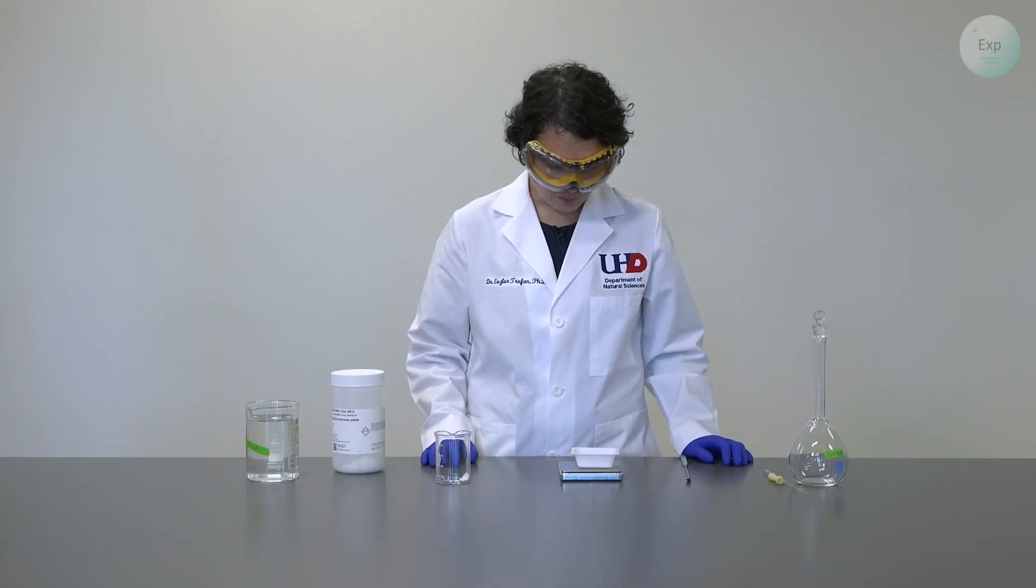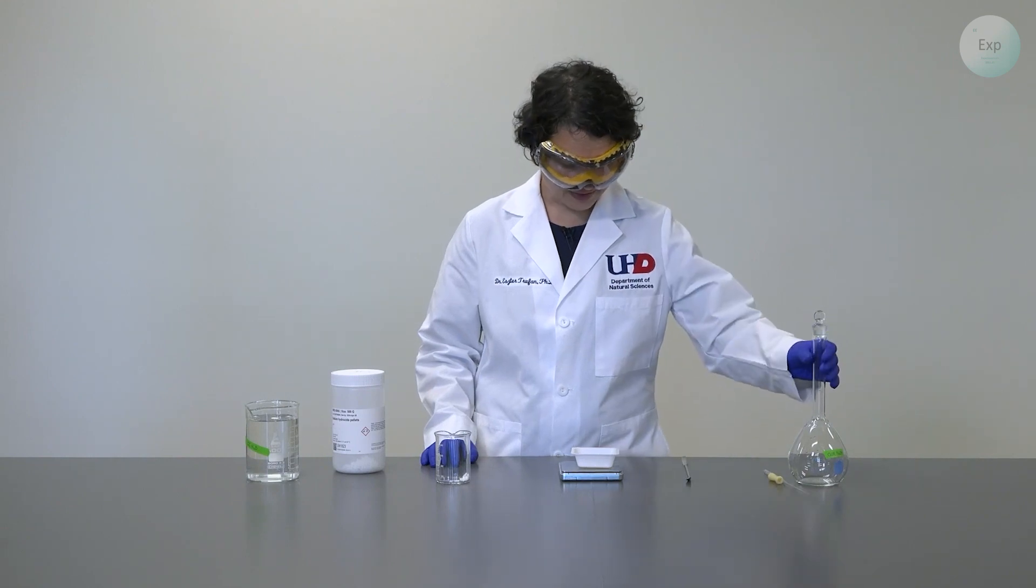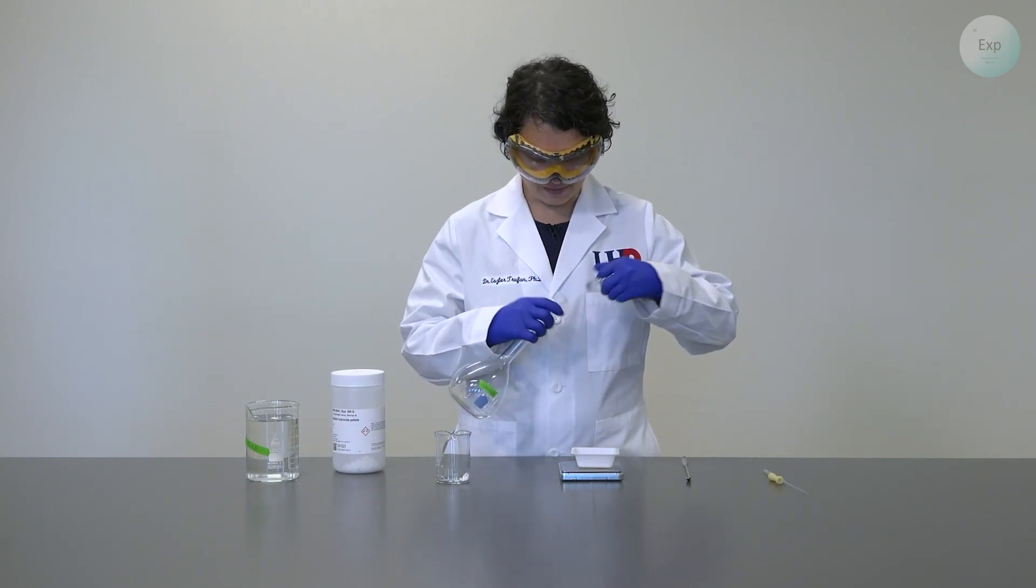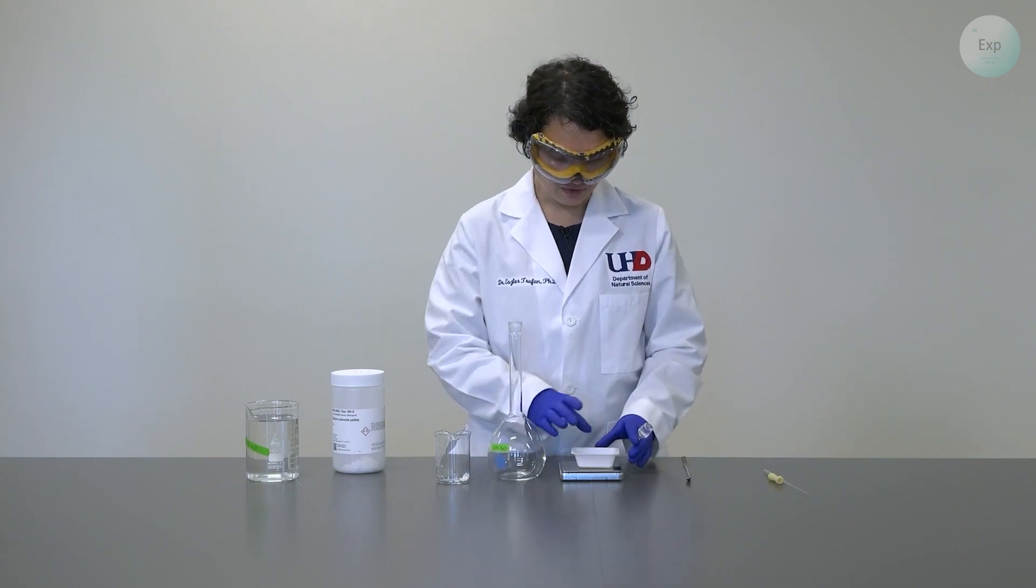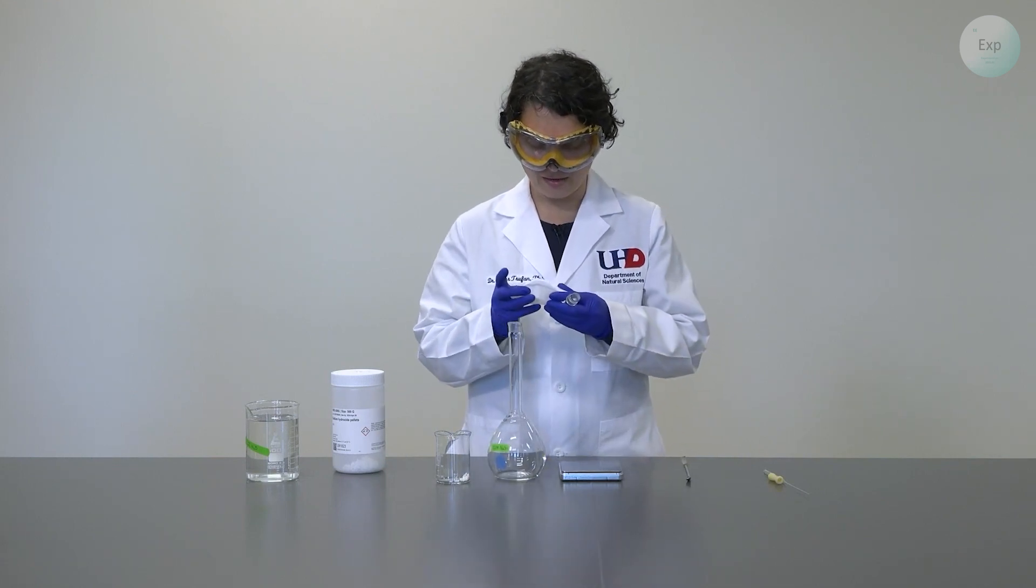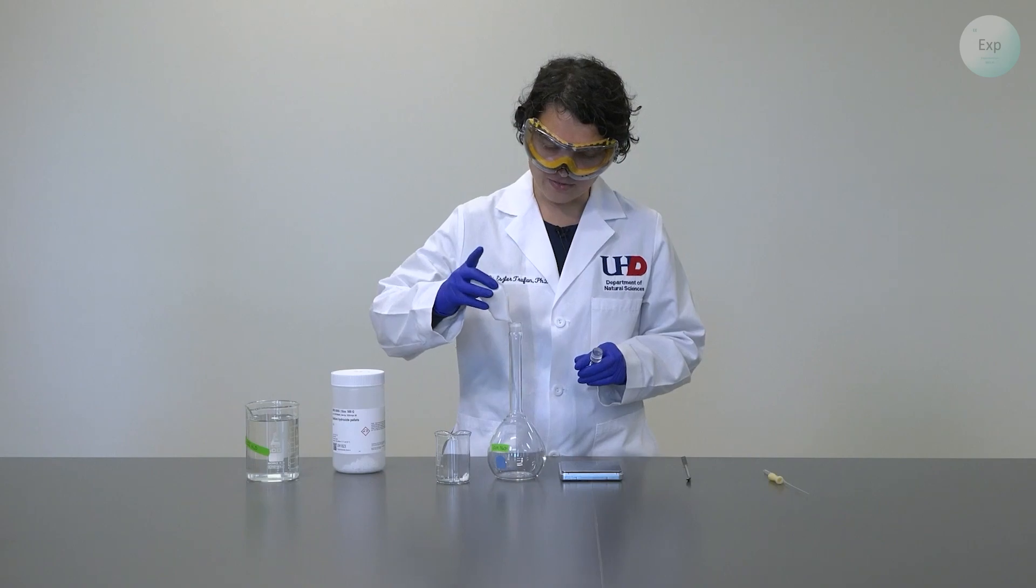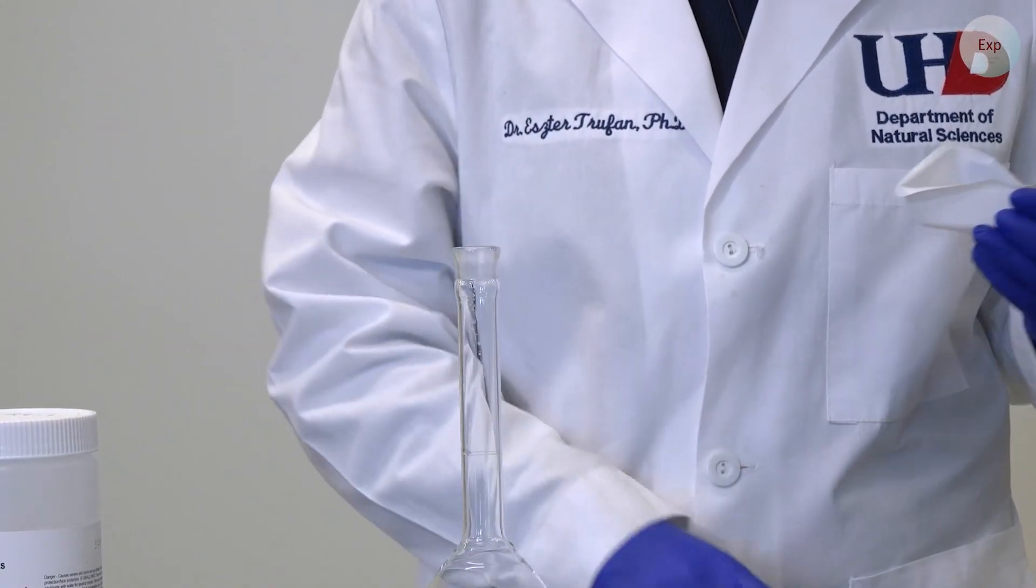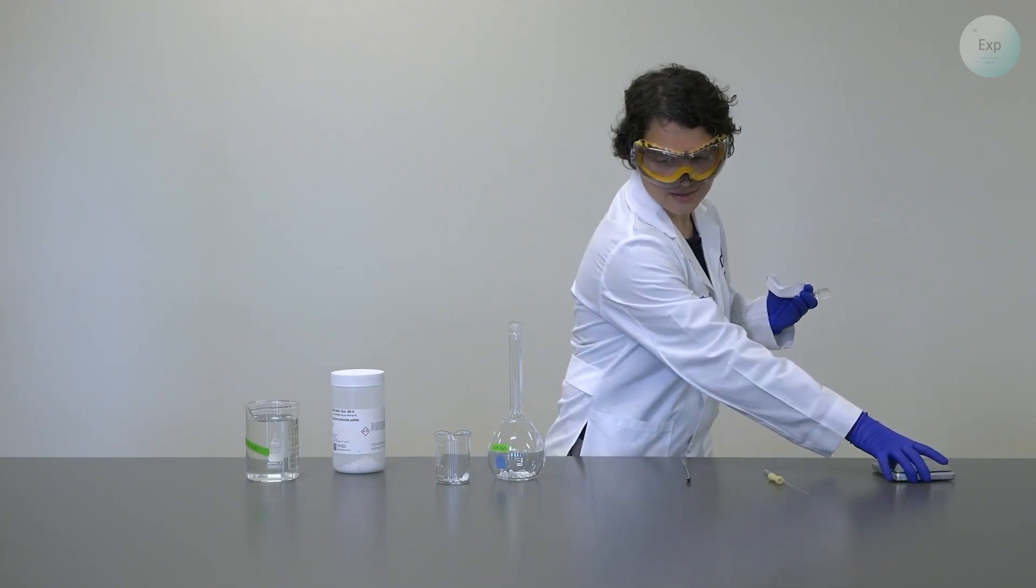I measured out exactly 2.00 grams of sodium hydroxide pellets. With that, I am done with my scale. I will take my volumetric flask, open it up, take my weighing boat, and transfer the sodium hydroxide pellets into the volumetric flask. With that, I can turn off my scale and set it aside.